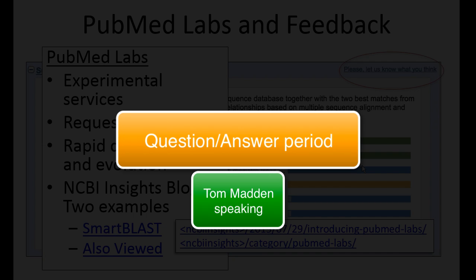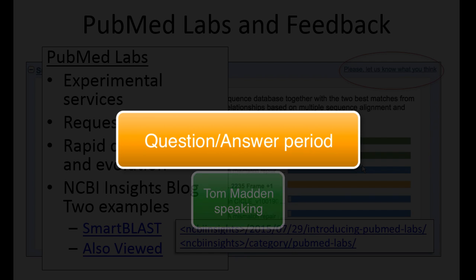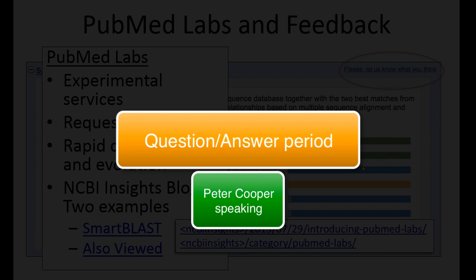As Peter was saying, SmartBLAST is doing two different kinds of searches. One is the KMR search, which is an alignment-free algorithm — we find that does pretty well down to about 70% similarity or so, finding the very close matches. The other part is a standard BLASTP search, which is as sensitive as any BLASTP search. Searching the whole of NR, you can go down to about 70%; searching the 27 proteomes it's a standard BLASTP. You can see pretty distant things there — it's quite common to find things where the only matches you get are to the reference database.